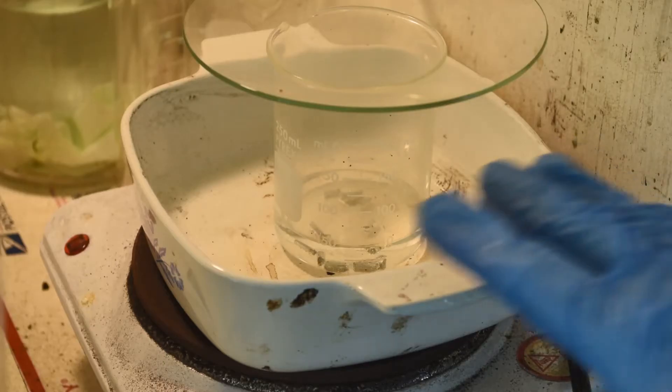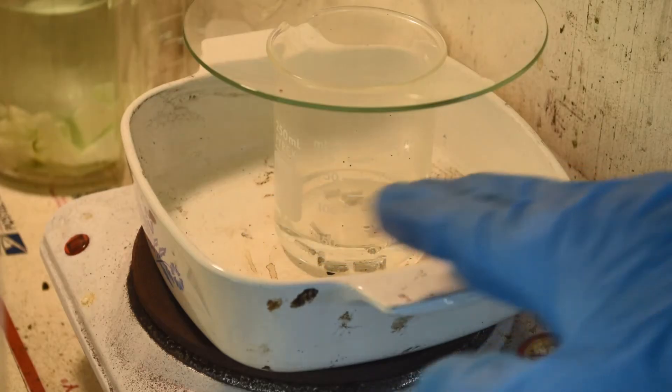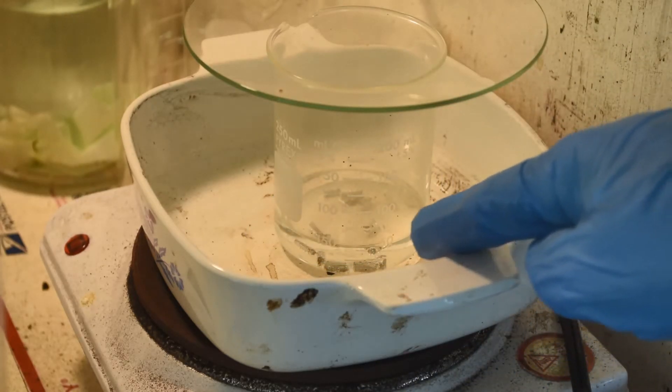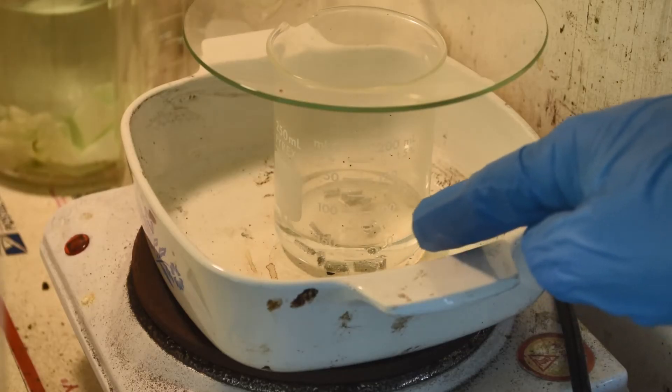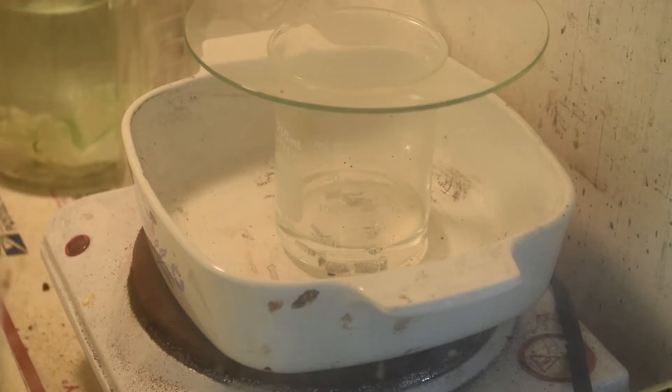Here we are in the fume hood. The hot plate really isn't even fully on — it's just still warm from something earlier. As the liquid warms up, the vigor of the reaction as the metal dissolves gets more and more pronounced. We'll just let that sit and dissolve; it should be done pretty quickly with the warmer hydrochloric acid, especially since it's a chilly morning and room temperature would take quite a while.